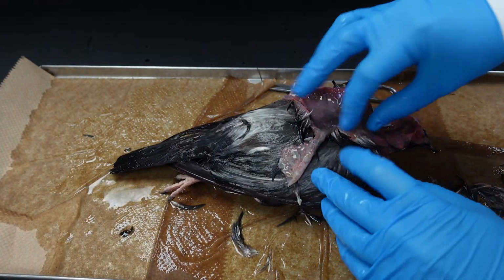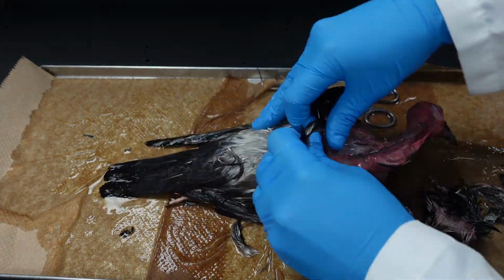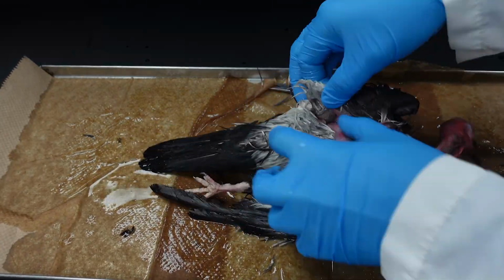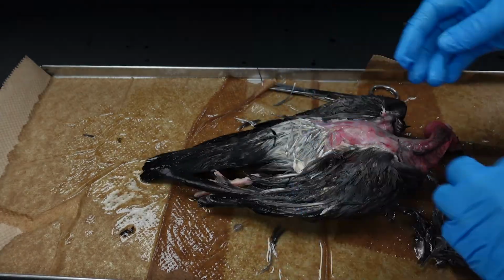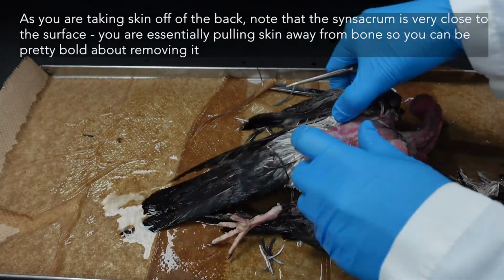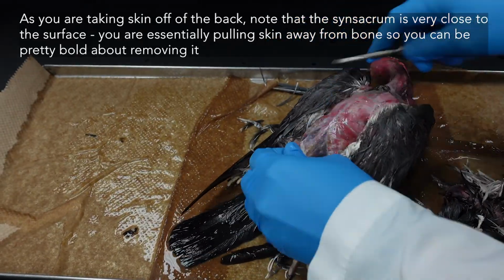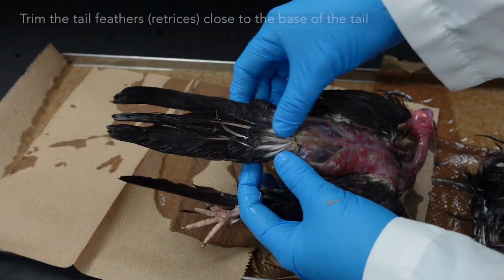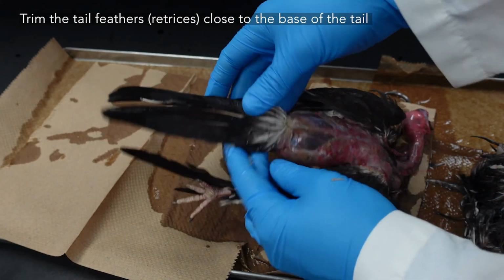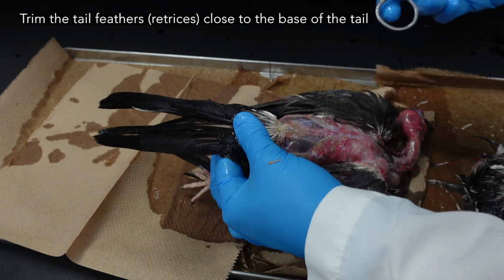Turning your bird over, you can peel the skin back from the back, and then we'll take a look at the wings. For the pigeon's tail, pulling up will actually damage the underlying tissue, so you do not want to pull those out. You want to just trim them close to the base.